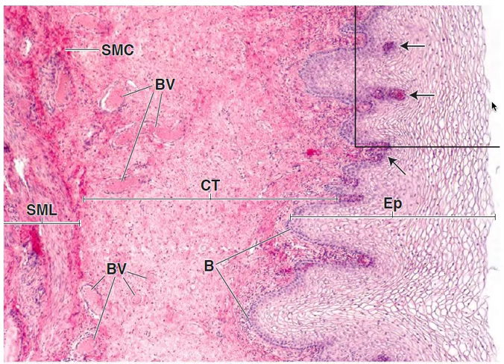Okay, so this picture. The mucosa of the vagina consists of a stratified squamous epithelium and underlying fibrous connective tissue that appears more cellular than other fibrous connective tissue. The boundary between the two is readily identified because of the conspicuous staining of the closely packed small cells of the basal layer of the epithelium. So this right here.